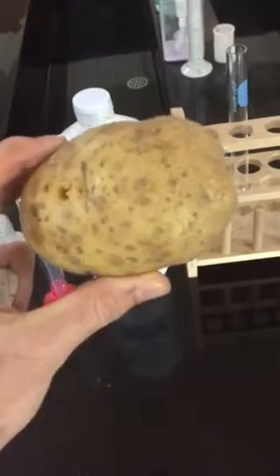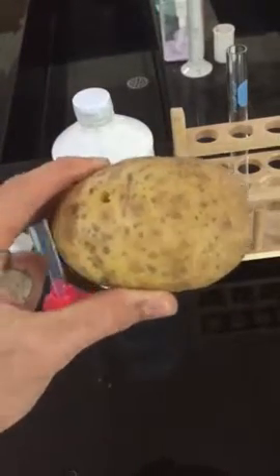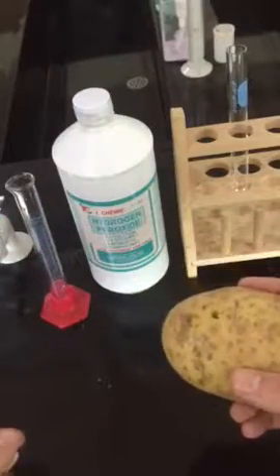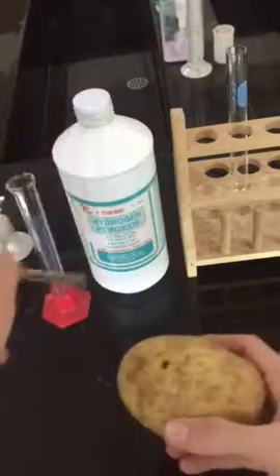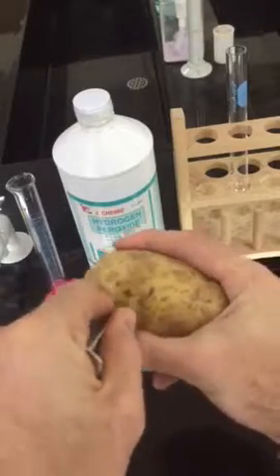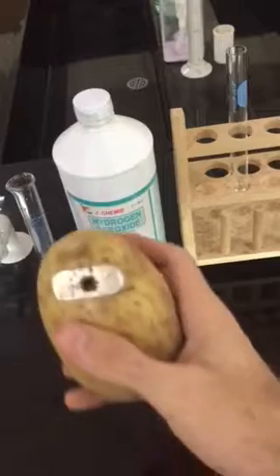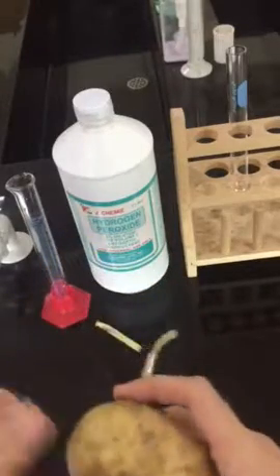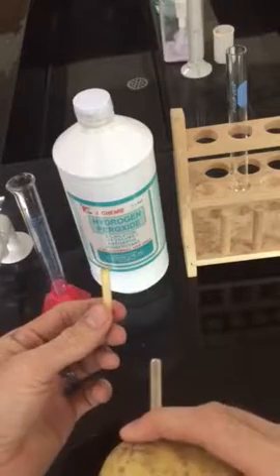Our enzyme, the source of our enzyme is the potato. Inside the cells of the potato is the enzyme catalase. I'm going to take a core sample out of the potato using a cork borer. So this is going to poke a hole in it. So I'm just going to punch it through here. Try not to take a punch out of my skin while doing it. And then I'm going to use this guy here to just poke that out. And so I'm going to end up with a core from the potato.